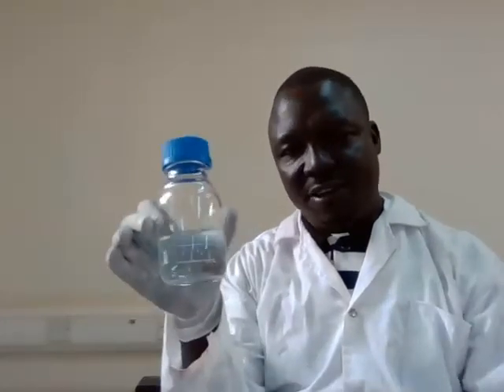So meaning that even the water that you're going to use must be sterile, and also must be free from other ions, because these different ions affect the growth of microorganisms. You will need to weigh this on our analytical balance, and then you dissolve in a specified volume of water. You dissolve it in here, then you take and put it.